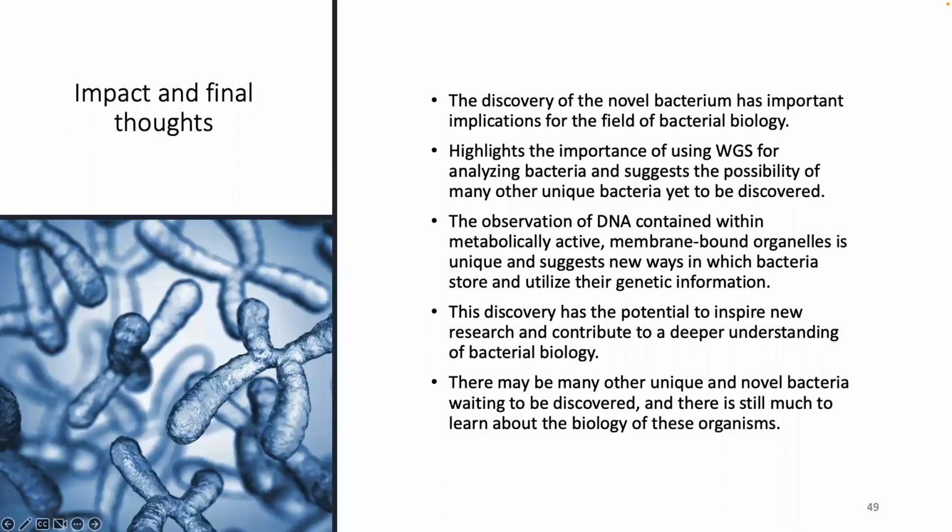Okay. So kind of touching back to our case study here. These researchers did use whole genome sequencing. We kind of talked about the size of the genome versus its closest relatives. They found that it had an atypical complement of cell division and elongation genes, which they believe is at least in part responsible for its dimorphic life cycle, where the centimeter-long bacteria kind of sheds off daughter cells that are a little bit smaller, almost like spores.